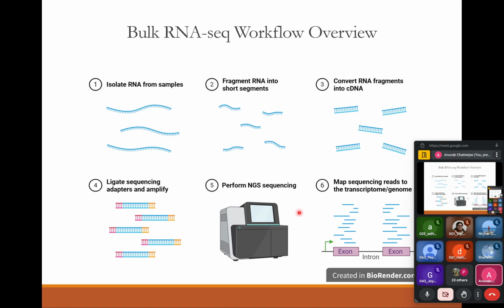So essentially, like a jigsaw puzzle, it will piece together all these smaller RNA fragments and form the entire RNA, and then I know, yes, this is the RNA for gene A, and I see there were 10 transcripts of it, so that information gets stored. So this is how you do the final assembly of the entire RNA sequencing data.